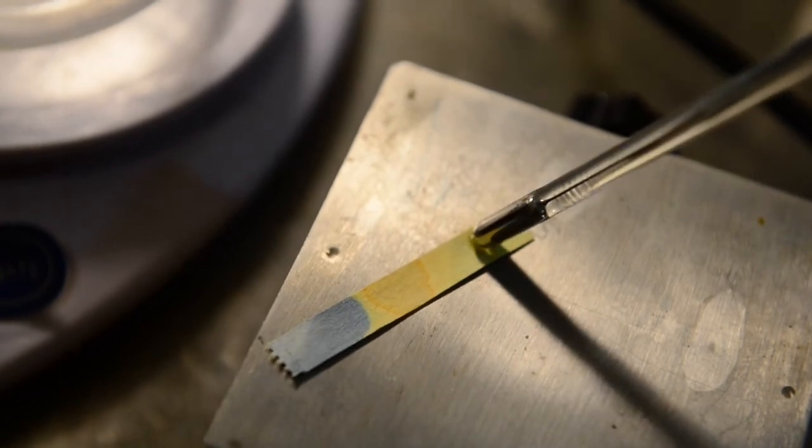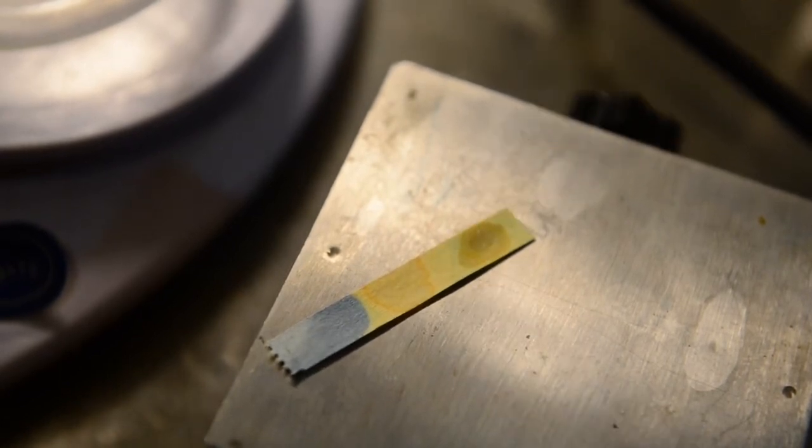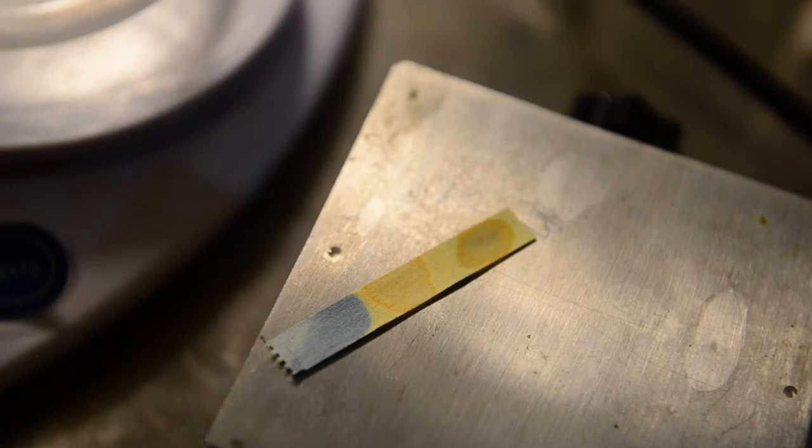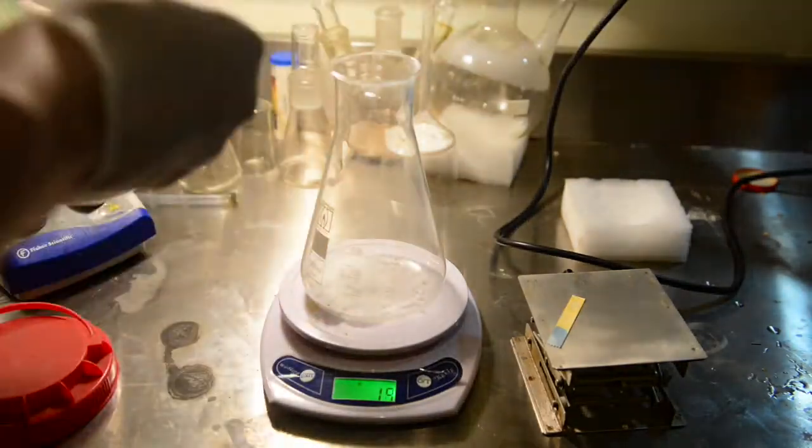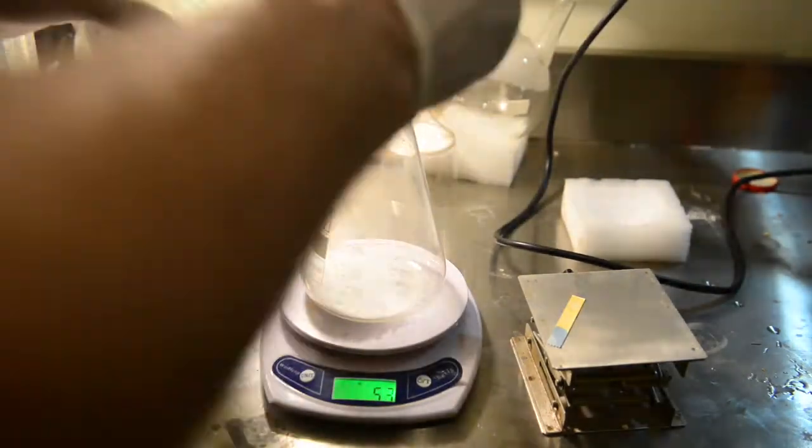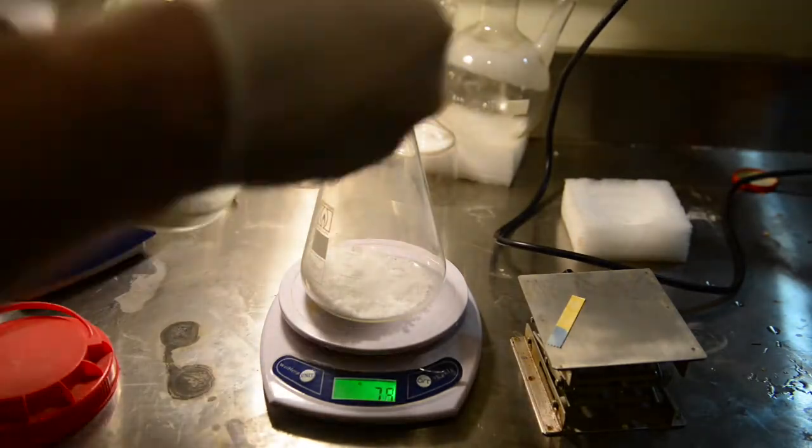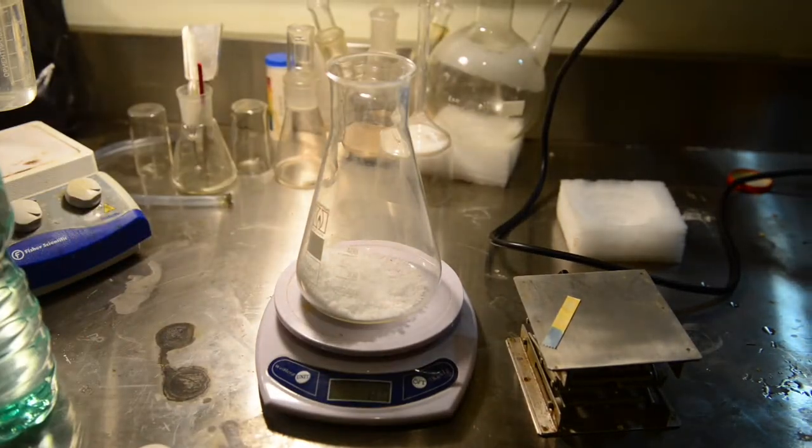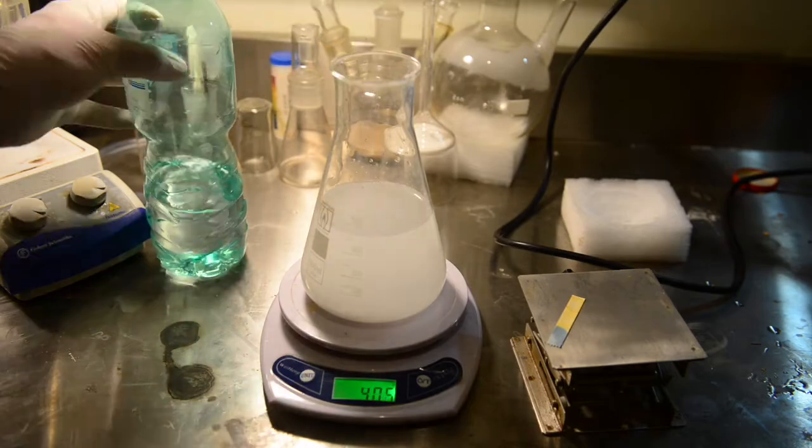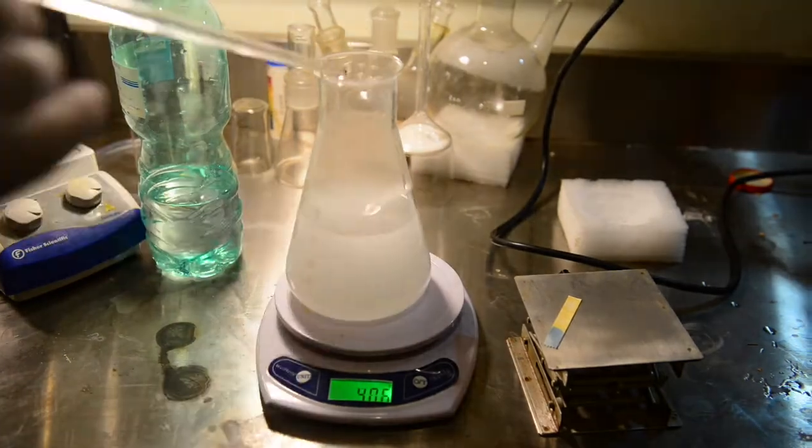First, let's check the pH of the liquid. It is acidic because of the formic acid present in the distillate. Make a 16% sodium hydroxide solution. For this, we took 80 grams of sodium hydroxide and 400 grams of distilled water. Stirred sodium hydroxide to dissolve and added our solution to the distillate.